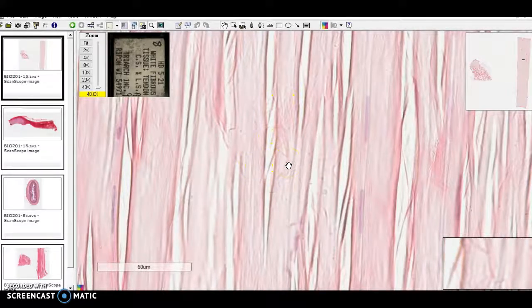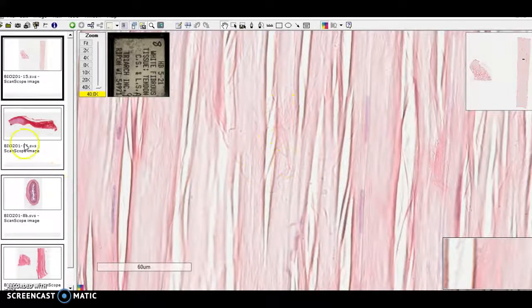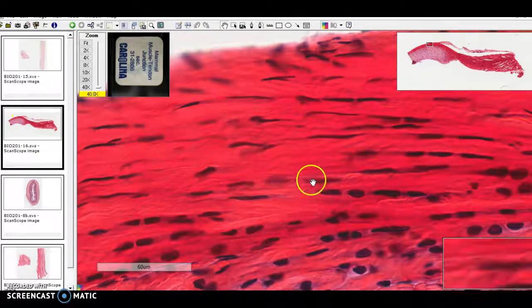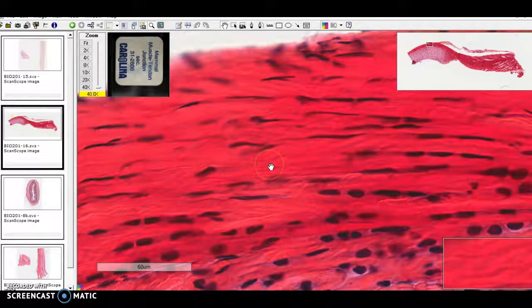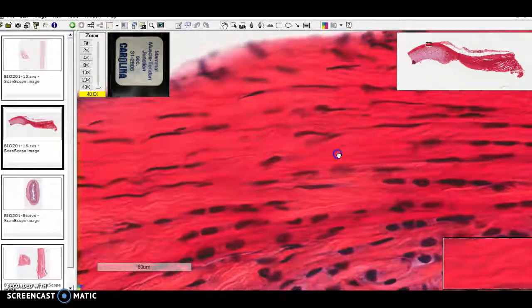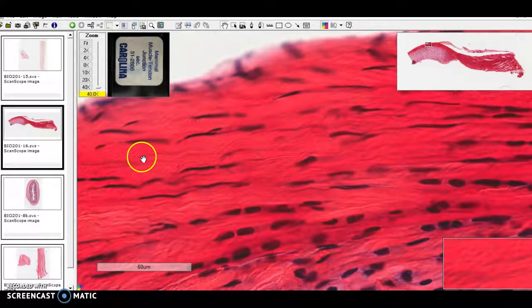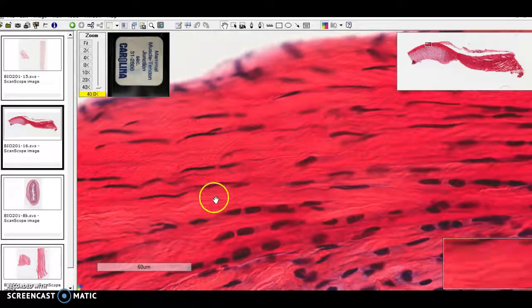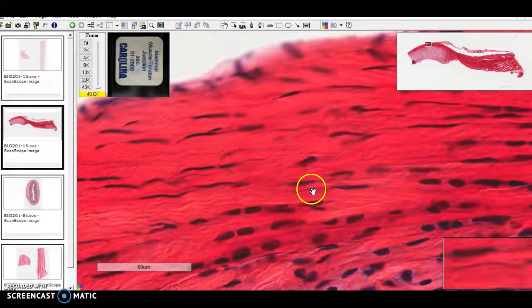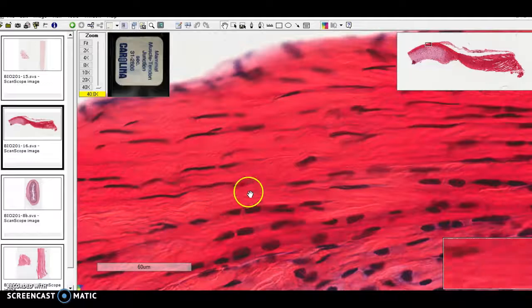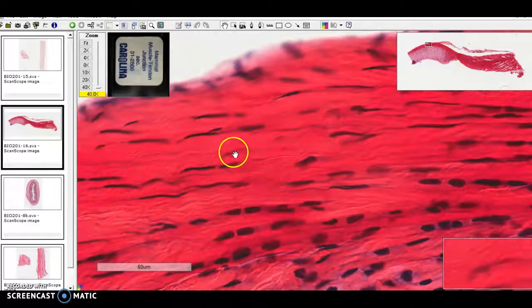Now there's one other stain for dense regular connective tissue. It might end up looking like this. This is a little less fibrosy looking, doesn't have that smooth cytoplasmic look that the smooth muscle had.